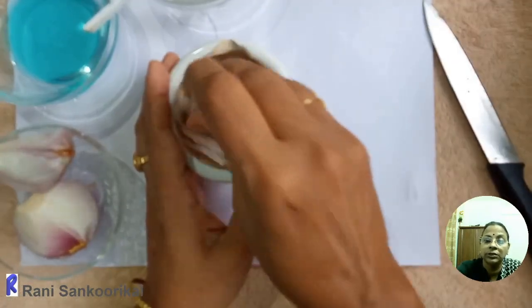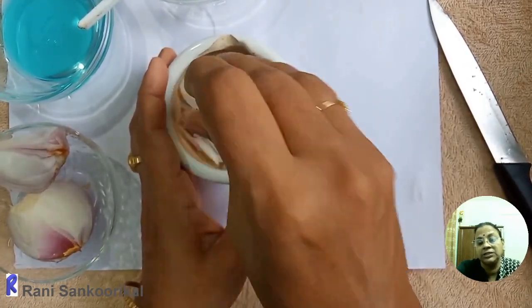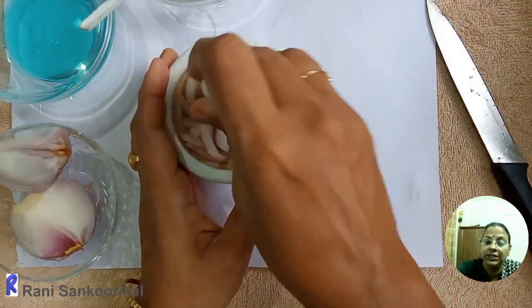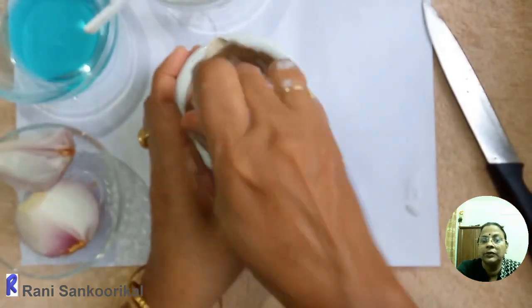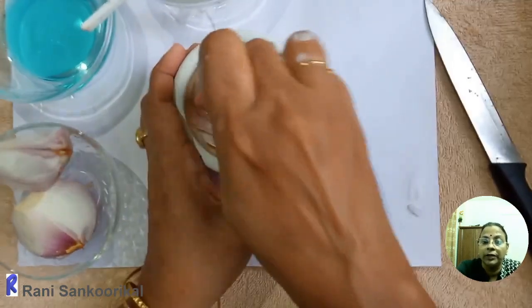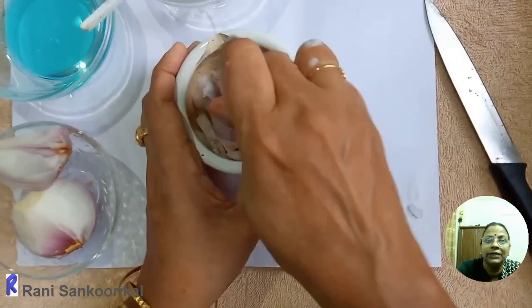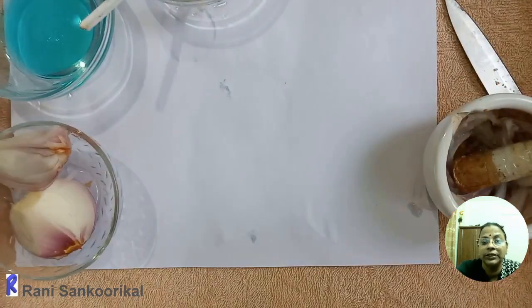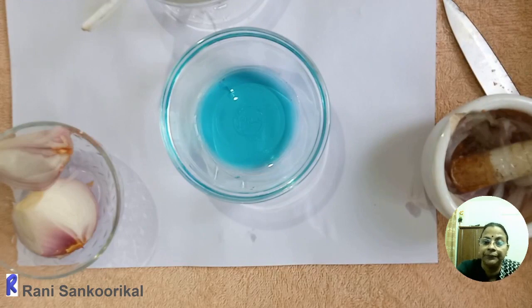The easiest way is to keep the onion pieces in the jar of a mixie and crush it for 2 or 3 minutes. But in the lab, we cannot provide a mixie or blender for everyone. So we provide the mortar and pestle. You have to crush it and make sure that the whole plant tissue is smashed properly. That's why the crushing procedure is a little bit lengthy. You have to crush it properly.